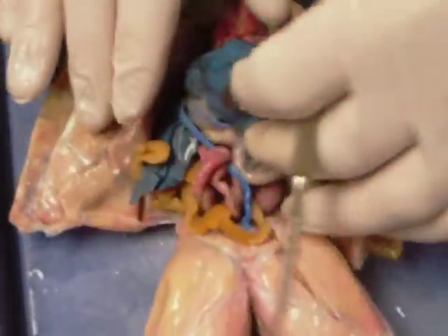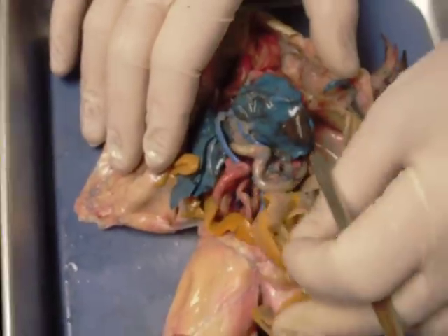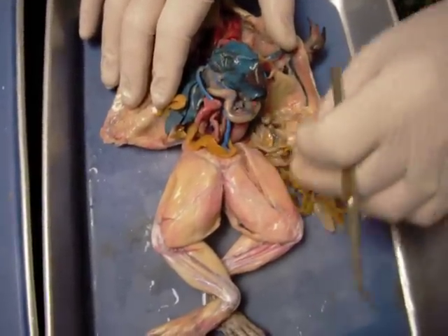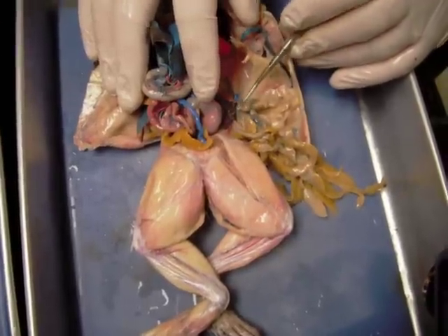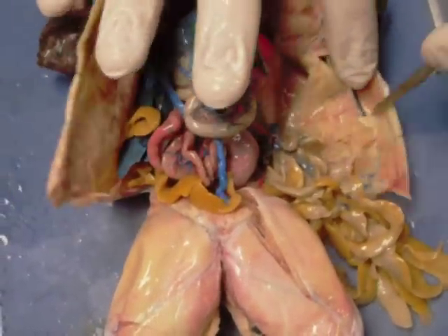Looking at internal anatomy: when you open it up, one of the first things you see are all these noodle-like structures. These are fat bodies — energy storage for the frog. Usually associated with these fat bodies we find reproductive organs, and that's the case here. Here's the testis. This is a male frog, so the testis is going to be small and hidden very deep in the body.